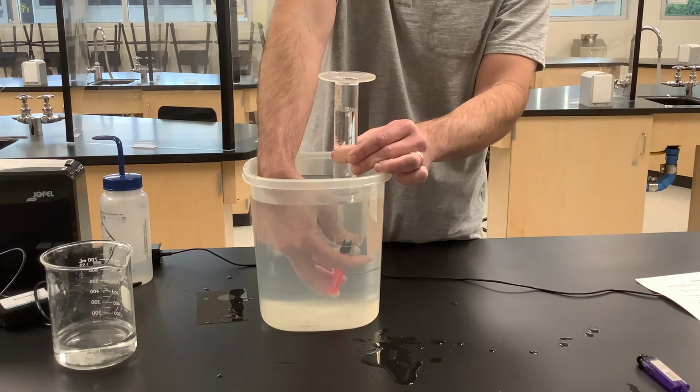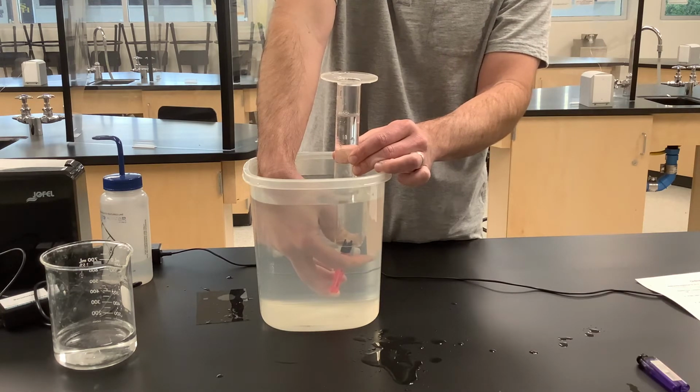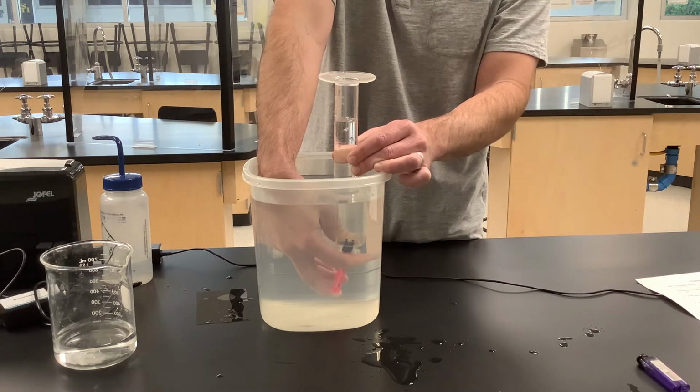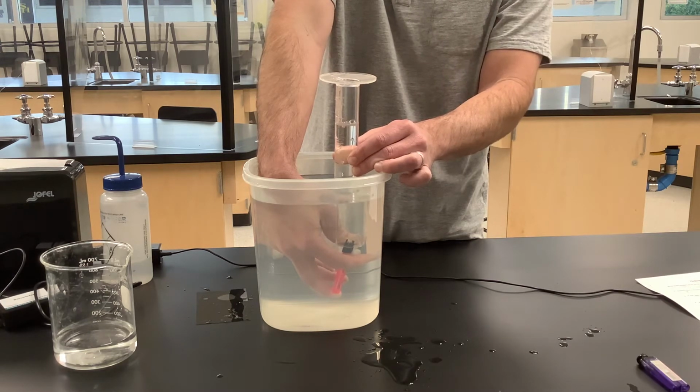But gas is actually really, really light, so I need to use quite a bit of this in order to get a significant measurement change on the scale. So I'm going to go probably for like 80 to 90 milliliters, somewhere around in there. We don't want to aim for 100 milliliters because that's the last measurement on this graduate. And if you go a little bit past it, then you can't read the value anymore.